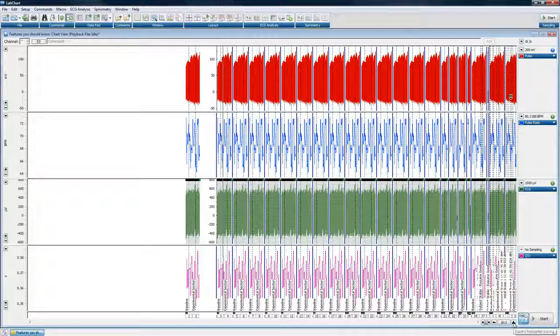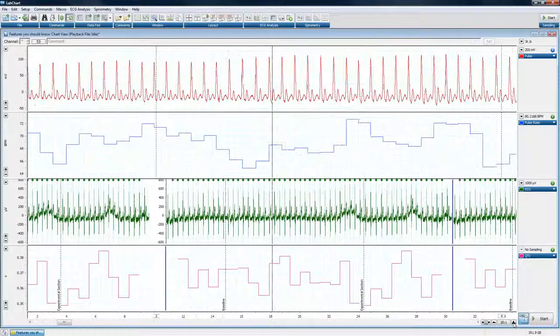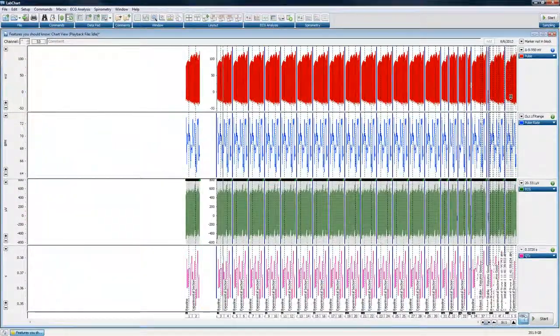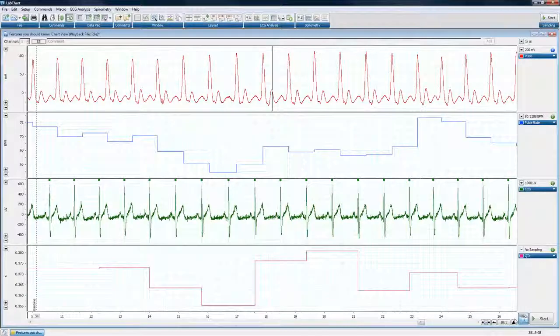I'm going to hold control and use the expand horizontal scaling button here and zoom in. And what's going to happen is that specific location where I placed my cursor is going to become the center portion of my screen. So if you're trying to navigate data, again, this is a great way to do it. And this is one of those things that I joked changed my life when I saw this. You have the ability to click on something that you see that's interesting, use the expand horizontal scaling, and zoom in on it. Okay, another great feature.